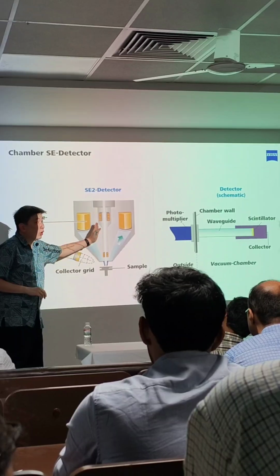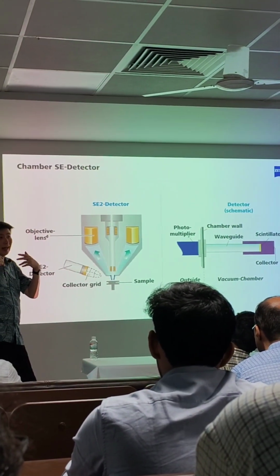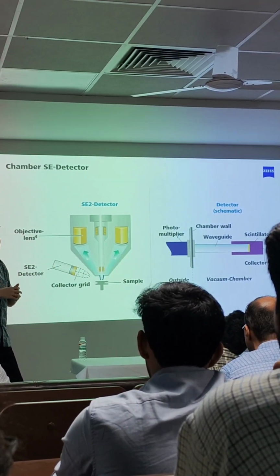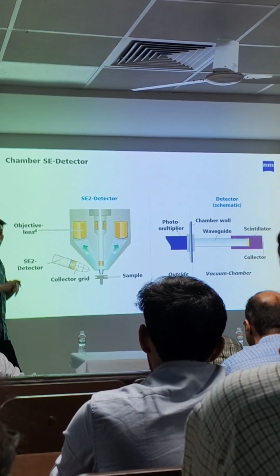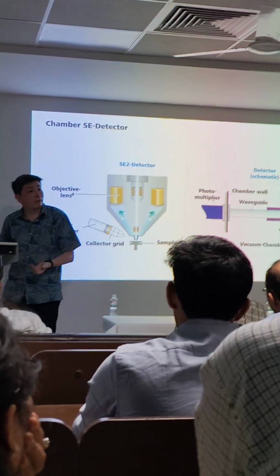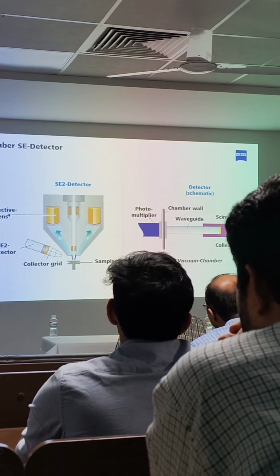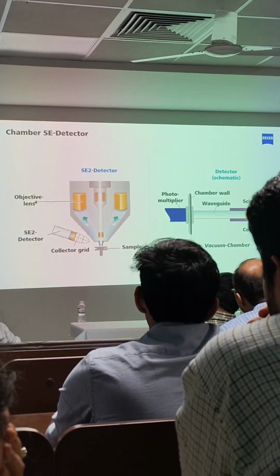The in-lens is on the column, right? It's accelerated, so you will see more backscattered kind of information. But of course, our in-lens can do both. Later in the afternoon we can see how it gives higher resolution. So it really depends on what we want. We can even have a detector below because it's STEM, so you don't have to buy a TEM. The students should really juggle with both detectors and see which gives the better effect.